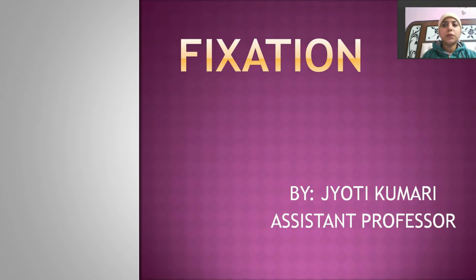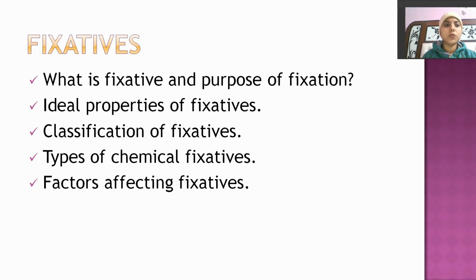So in this topic, today we are going to discuss fixation. These are the key points which we will study in this PPT. First is what is fixative and the purpose of fixation, then ideal properties of fixative, then classification of fixatives, then types of chemical fixative, and then factors affecting fixation.